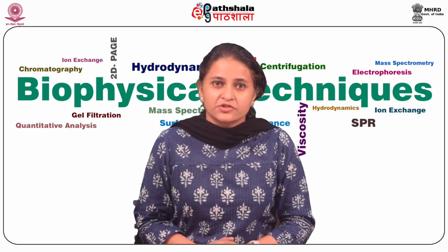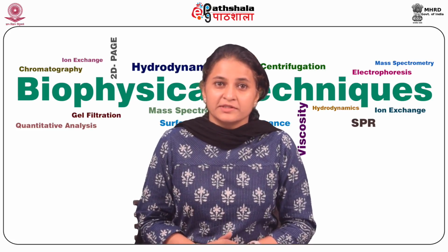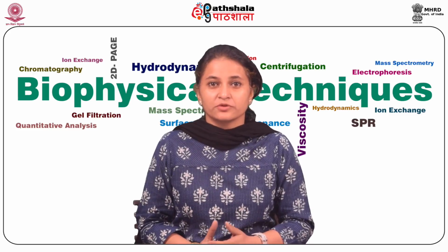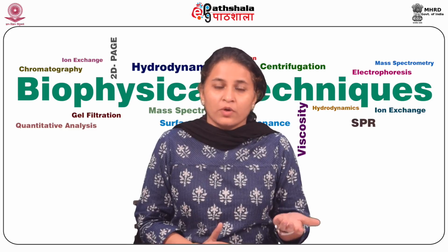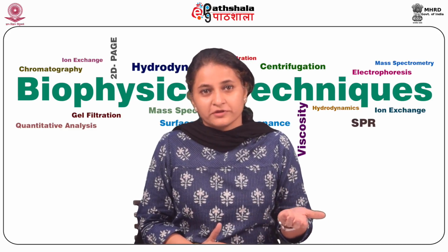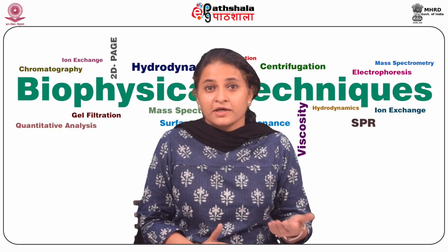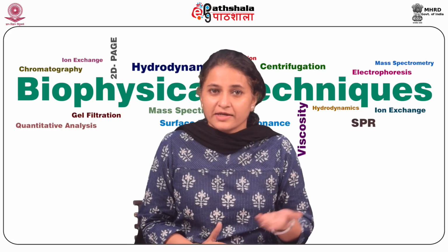As we have discussed during the practical aspects of GC method development, derivatization may be needed to convert a compound so that it is amenable to analysis by gas chromatography. One of the examples of derivatization, which we do also in our labs, is conversion of fatty acids to their respective methyl esters.